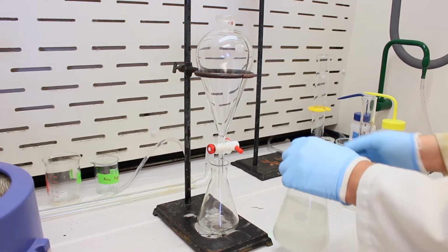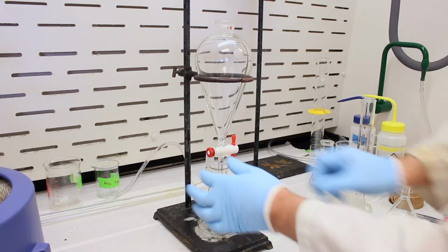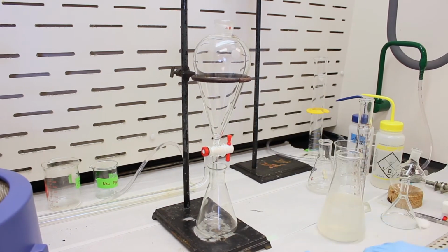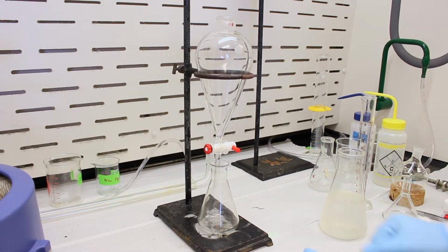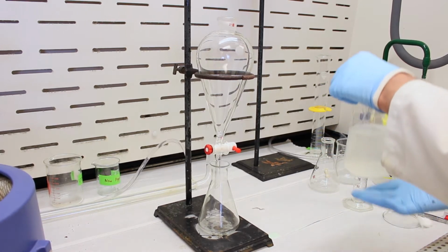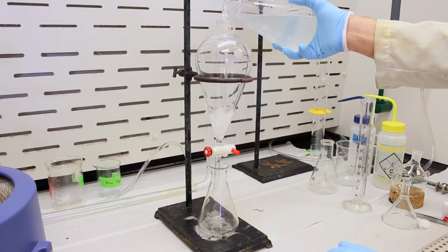So we have our sep funnel. This is the stopcock. When the stopcock is vertical like this, the hole is aligned with the stem and the liquid can flow out. So it's always important that you keep this closed when you pour liquids in, or else stuff will fall out. That's a rookie mistake, don't do it. So we have our distillate, which we will transfer to the separatory funnel.